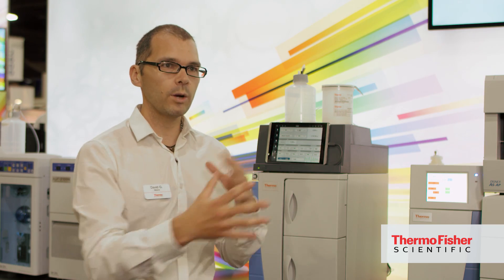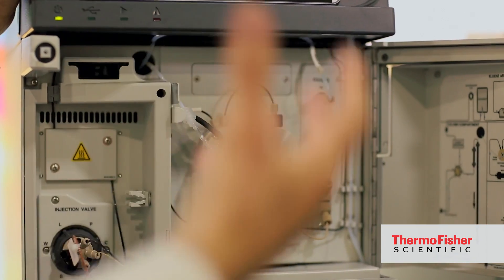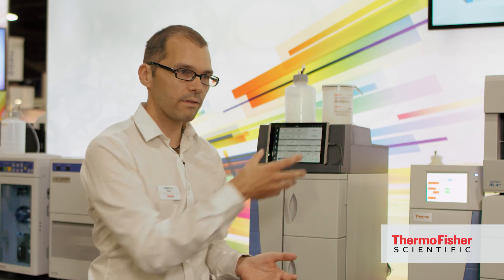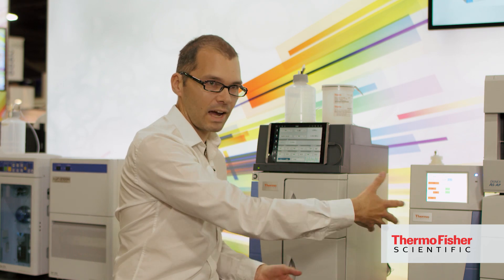We designed this whole system from the ground up keeping ease of use in mind. You'll notice when you open up the instrument the plumbing layout — the fluidic pathway — is simplified. So instead of having a lot of tubing crossing each other, you have a general flow around the system of the eluent and then out to waste.